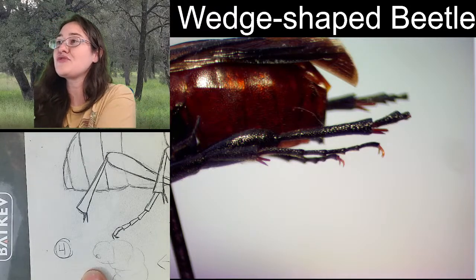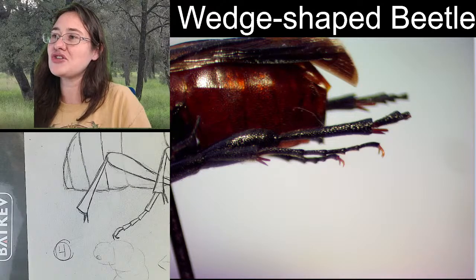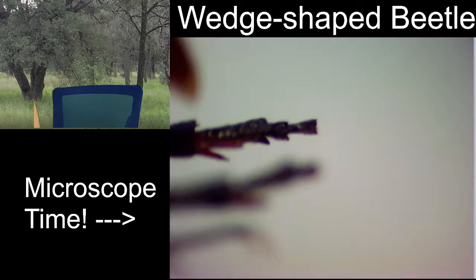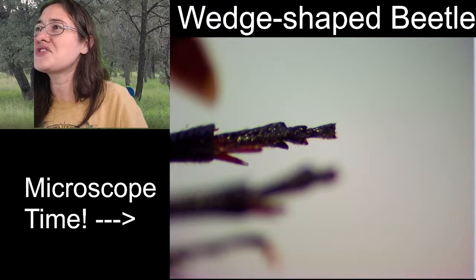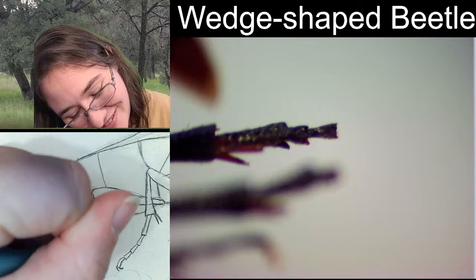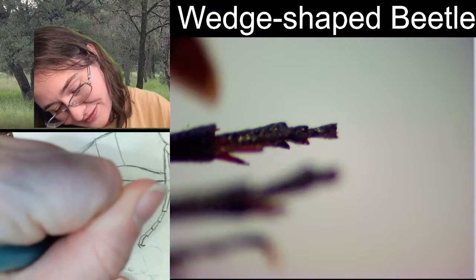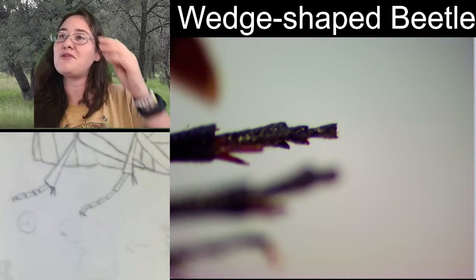Although we can only see three, I think if we can refocus this so that you're looking at the hind leg, because at least the other side, oh, I had moved it. Because at least this one, ooh, that one has three of its four tarsal segments. One, two, three. And I'm going to give the last tarsal segment, I'm going to make it rounded and put claws on the end of it.